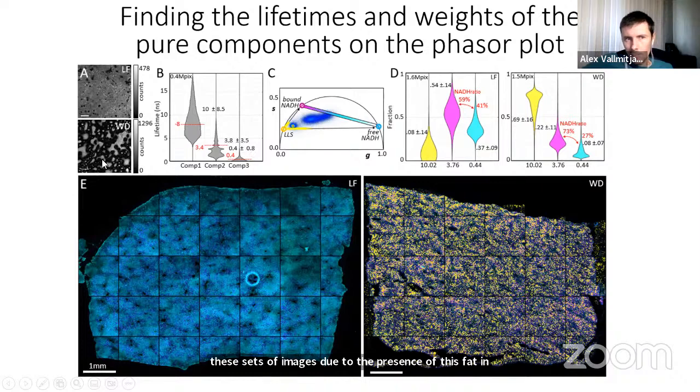This looks here like basically oil specks on your sample. When I first saw this image, I thought it was just a dirty sample. They'd forgotten to clean the oil off the glass. But this is actually the liver chunk in which you have these gigantic balls of oil.